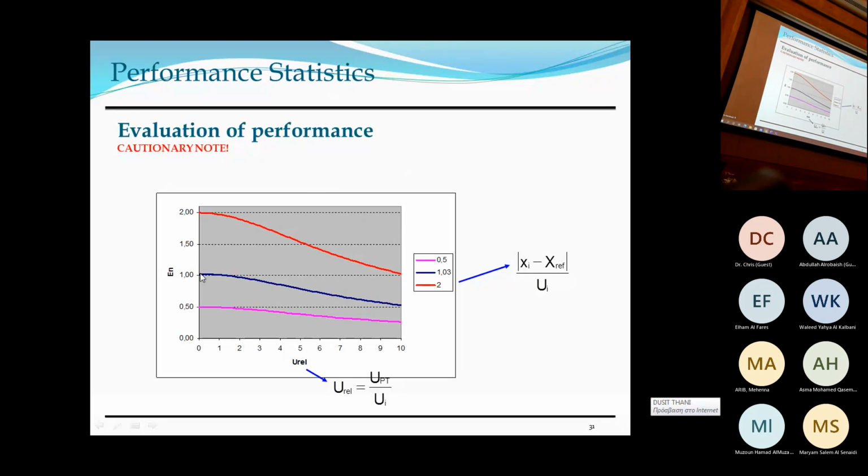Here, the EN number was a little bit over 1, so on the limit it doesn't pass. But once the instability kicks in, if someone is starting to take account of it, it falls all the way down to half, so it passes with flying colors.